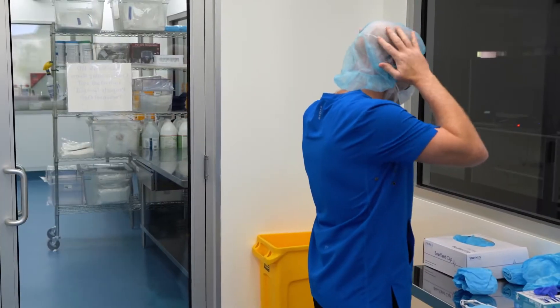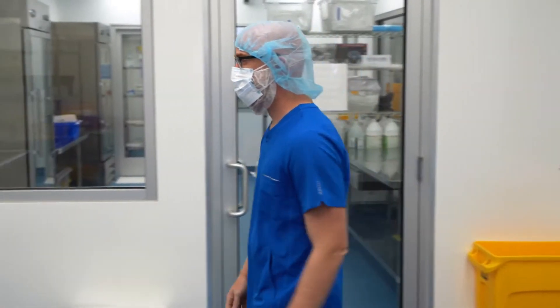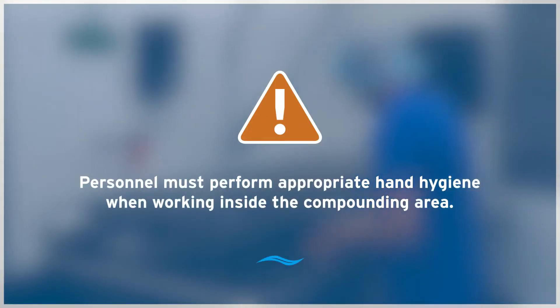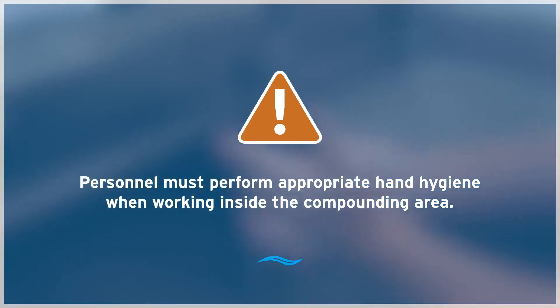Per the facility's standard operating procedures, documentation, and USP requirements for compounding non-sterile preparations, personnel must perform appropriate hand hygiene when entering the compounding area.